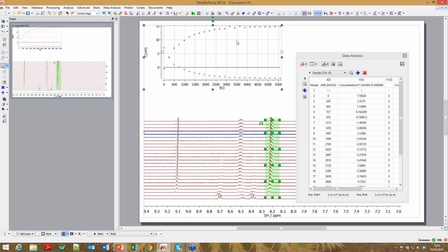You can also use this to delete rogue points. So, for example, this point right here, I might decide is just a little bit off, and I'd like to delete it. So I can take that one away. I can delete that one, if I want to get slightly better curves. This is important when you have curves that track over and actually cross over a different peak.